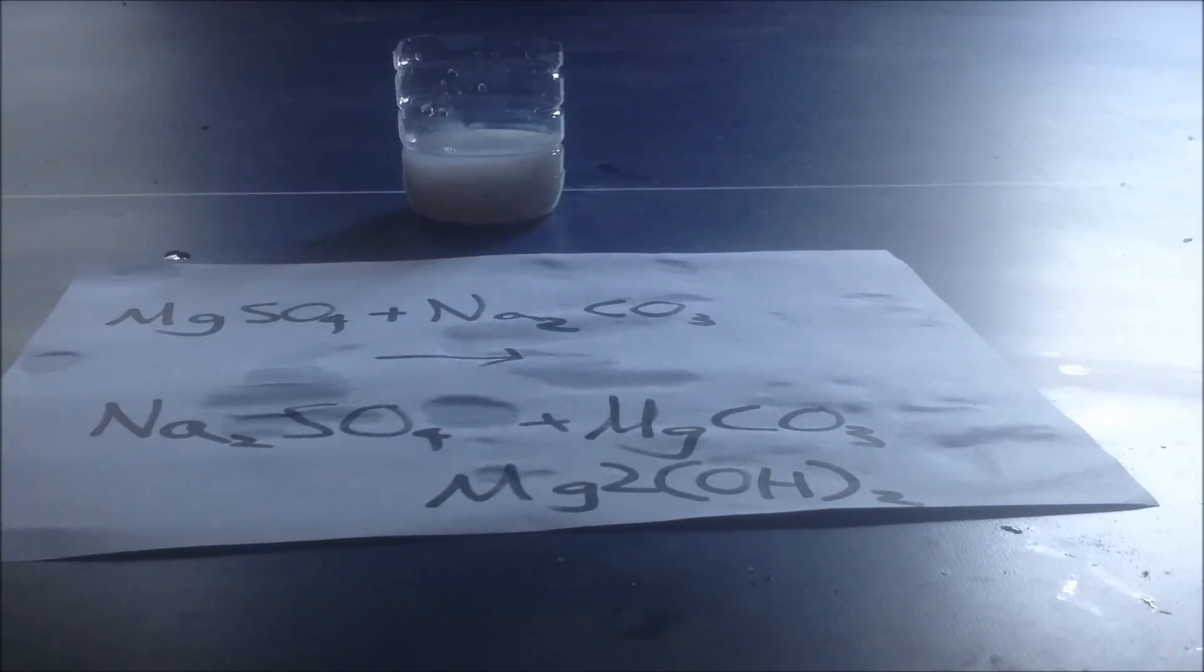Put it on the table and just pour a bit of the solution on. A cream will rest on the top of the paper. You just scrape that off. That's your magnesium carbonate and magnesium hydroxide.